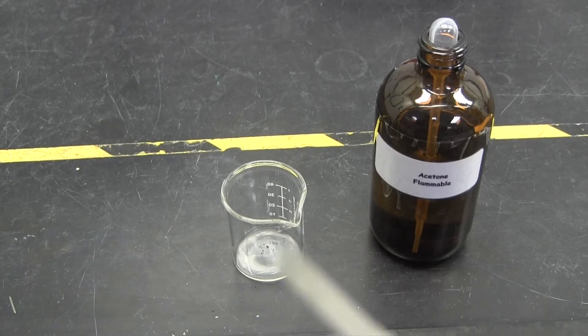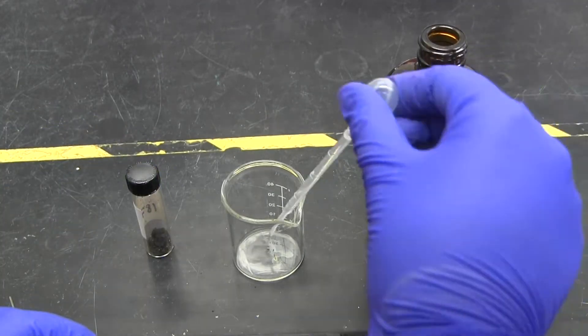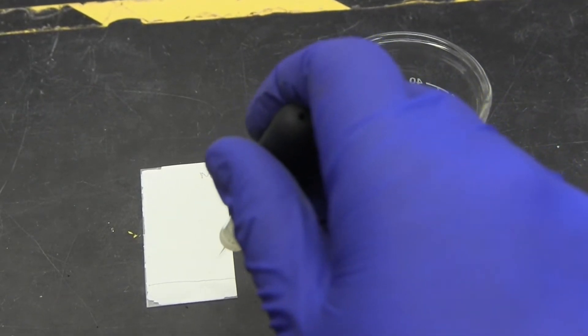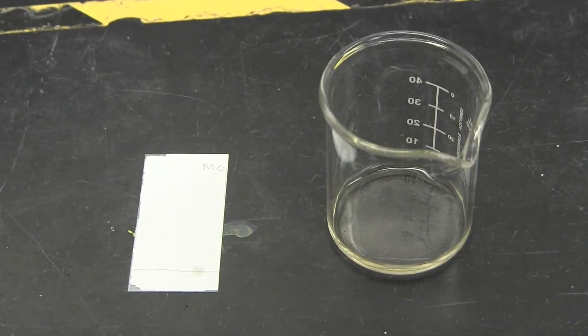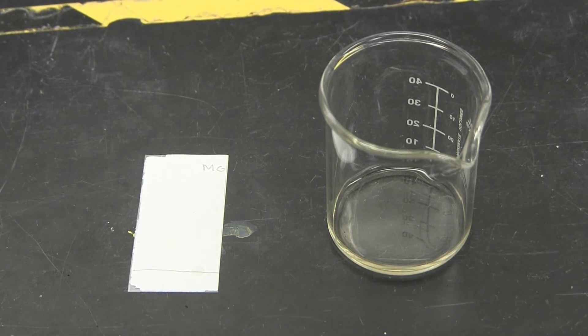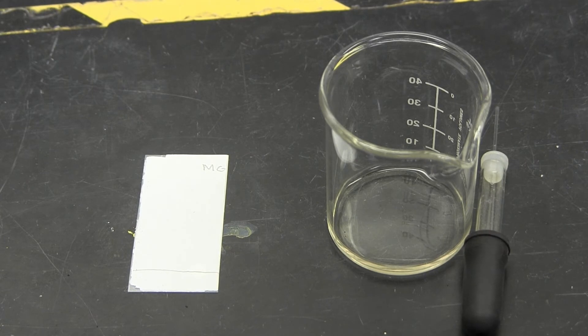Create a standard using a drop of your unknown and one milliliter of acetone. Using a capillary tube, dot your standard on the pencil line at the bottom of the plate. You will use the same capillary tube the entire lab. You do not need to squeeze the bulb. The tube will suck up liquid on its own using capillary action.